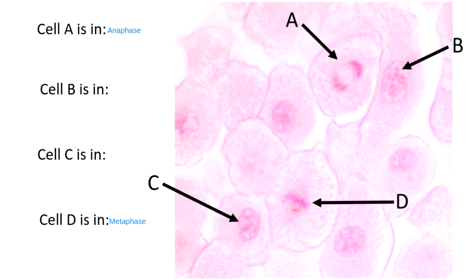Okay, so one of my groups typed in. Perfect. Okay, so it looks like we are agreeing. D is definitely an example of metaphase, absolutely, because we can see those chromosomes meeting in the middle of the cell. Perfect. And one of my groups voted anaphase for A, and I would agree with that.